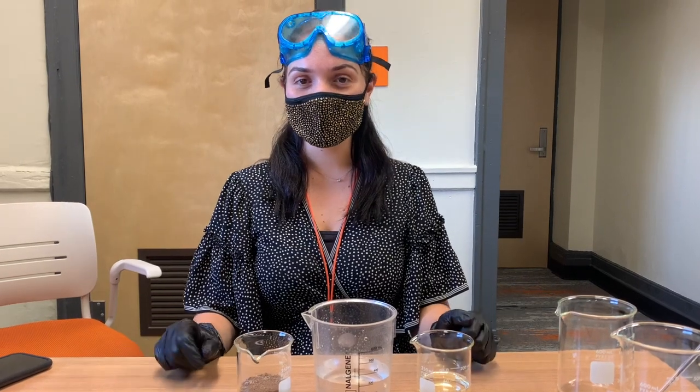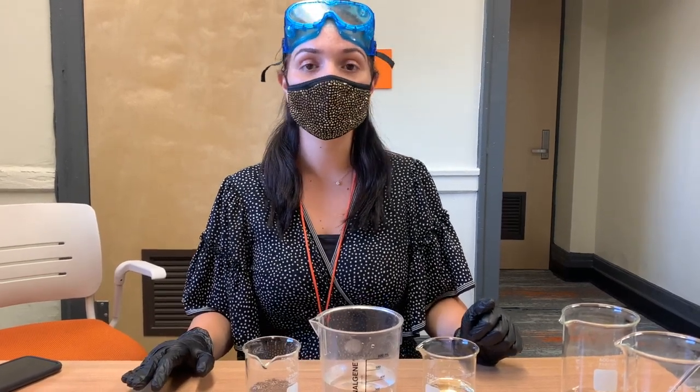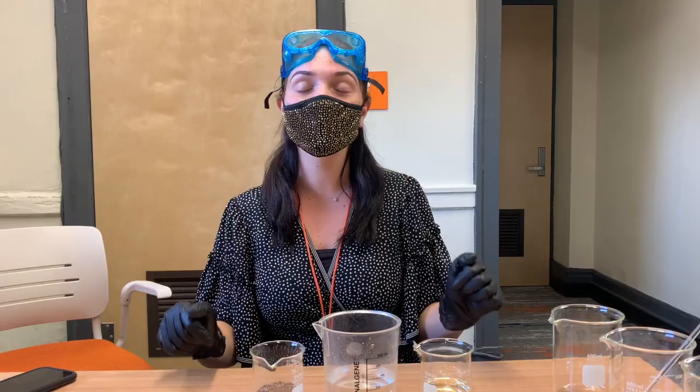Hi class, Miss Arlia here. So now we're going to discuss the decantation process. So decantation is a process for the separation of mixtures that aren't actually supposed to be mixing. Another way to say this is immiscible liquids. So these are liquids that otherwise shouldn't be mixing, wouldn't work to mix. You could also do this with a liquid and solid mixture, such as a suspension.